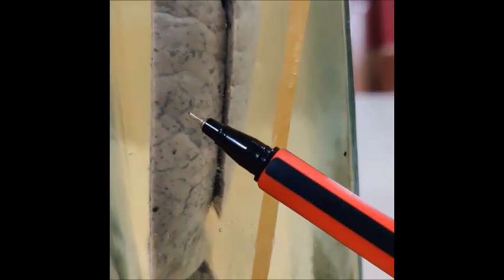So this is the surface. That is a pleural surface. We have just mounted one slice. Can make out even the pleural surface. Normally the pleura has a glistening appearance. It is shiny. But here you can make out it appears quite thick, and pleura also is inflamed. See, look at the surface, pleural surface.